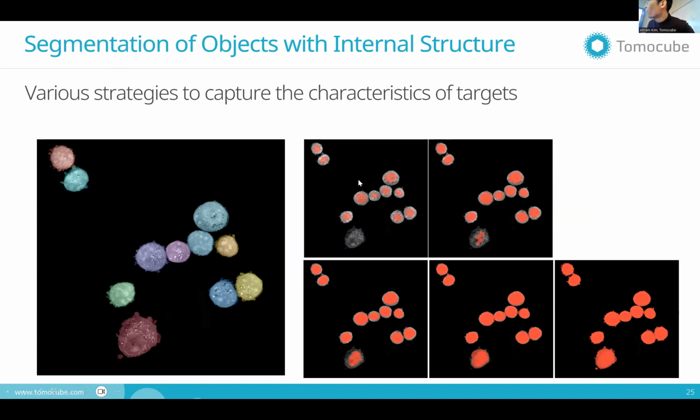On the first image, we identify the cell center, which is mathematically calculated. Then we lower the RI value for growing the cell size like this. Successively, we extend the cell surface to the very boundary of the cell and reach the final boundary. From this approach, we can segment those cells even though they are touching each other.